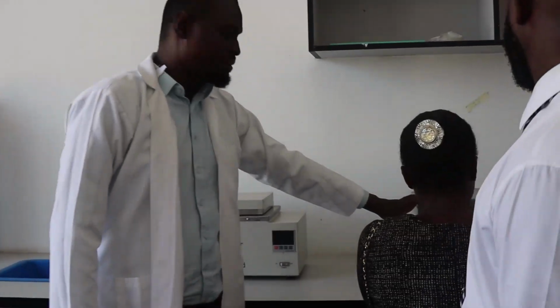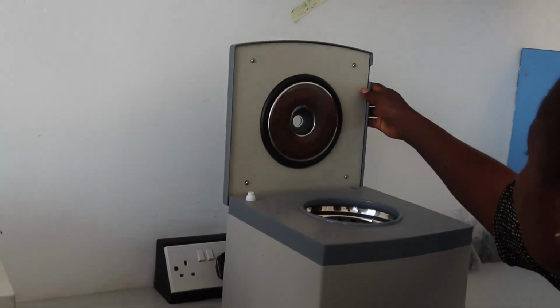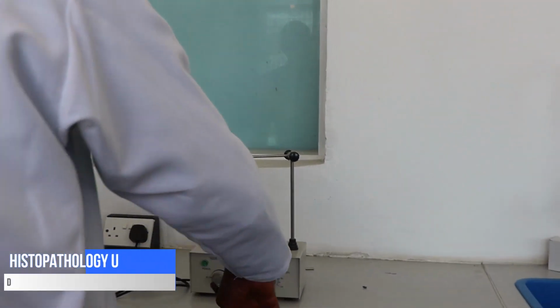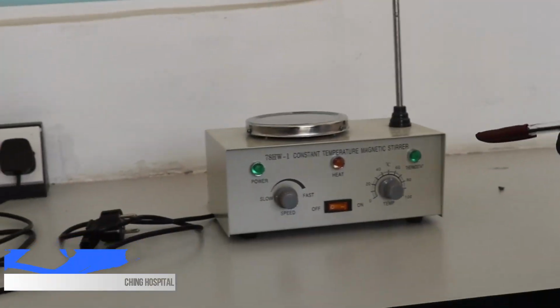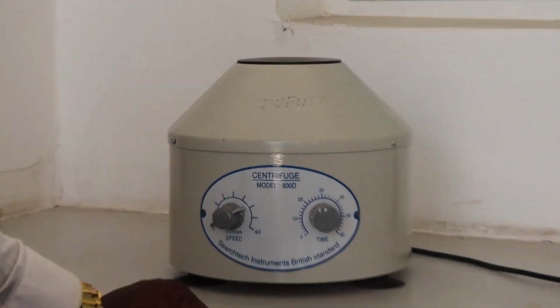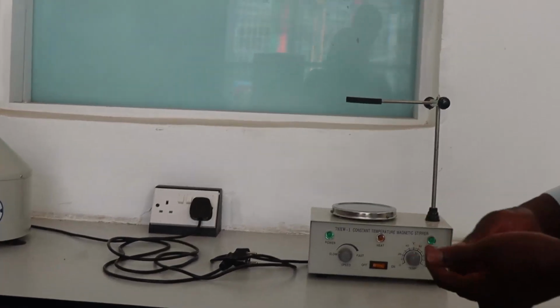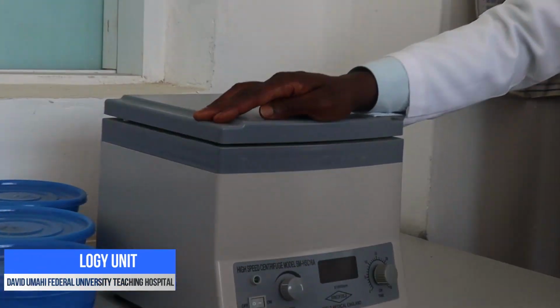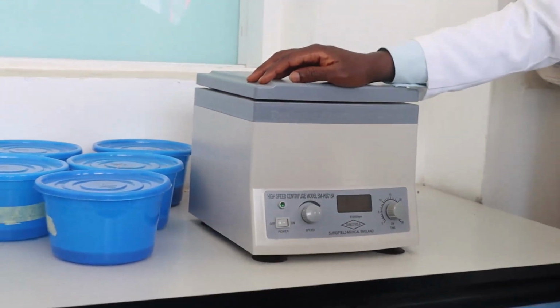This is a centrifuge where some liquids, like urine for cytology, we spin to get the extract, the sediment. When we get the sediment, we use it and view it under the microscope. This is a weighing balance. We use it to measure the weight of tissue, so that we know the weight the tissue has. This is a centrifuge too. We use this centrifuge to check the cervical smear. We spin the cervical smear so that we get the extract and view it under the microscope. We use it to centrifuge cytological samples and keep them ready for viewing.